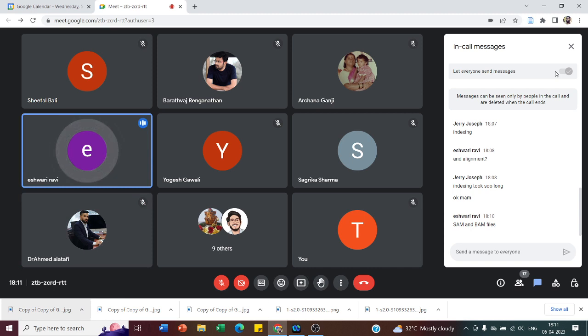After you finish your alignment, the main part that comes is variant calling, as I had mentioned. One second, I can show you an example of a SAM file. I cannot open it on my system because it is a very huge file, but I'll share a screen. You can just refer.